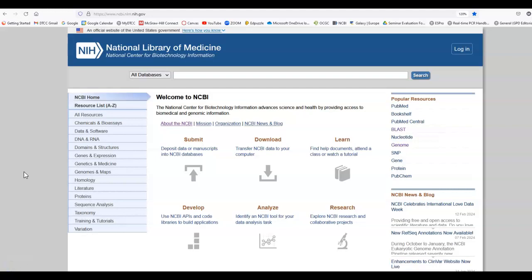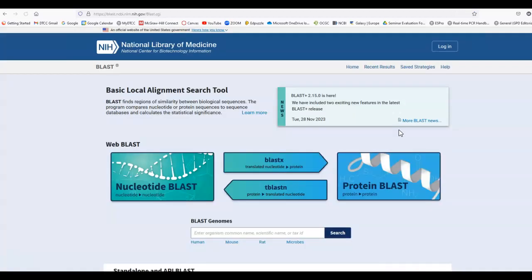Hey guys, this is a little bit more detail on some of the different BLAST outcomes, so you can get a sense of how that works and what they do. So the first thing I want to do really quick is spend a minute or two on what these things are. Nucleotide BLAST, or BLAST-N, is obviously looking for nucleotide similarities from your query to all the subjects that are in the database.